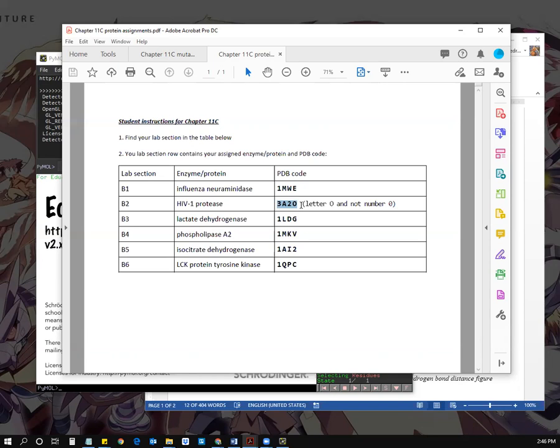It looks like a little spider-shaped or insect-shaped thing, and that's not quite correct. So I'm going to look at this file and get back to all of the B2 students. I'm not going to give you extra work to do. I'll just give you special instructions so that you can finish your PyMOL post-lab write-up.